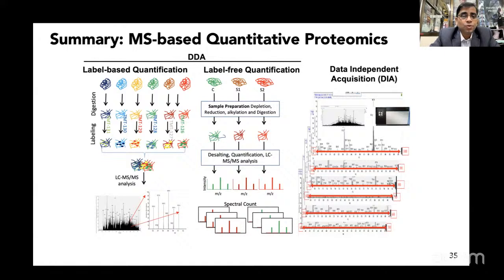And as you can see, to reach the final biological conclusion, there are many technical routes which you have to follow. Depending on what your project design is and what your sample size is, you can choose one of these paths. Once you know the basic mass spec workflow, the nuts and bolts, and the software and workflows for these analyses, you'll be better placed to get a good outcome from the biological problem you want to understand, and you will have a much more concrete idea of the proteins you can take forward for your next set of hypotheses, for validation as well as further understanding and characterization. I think that's all from our side today.